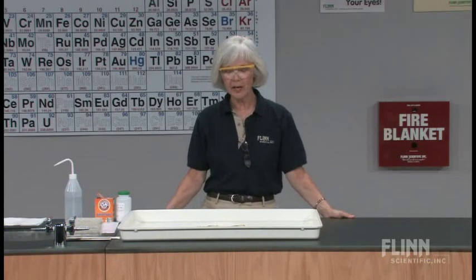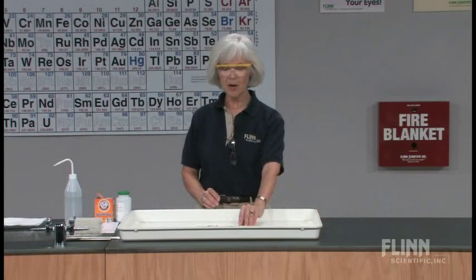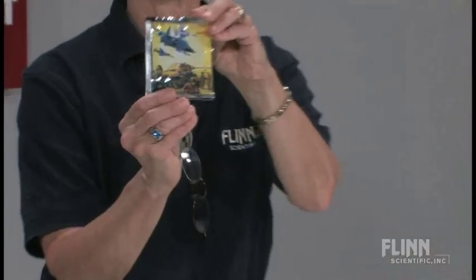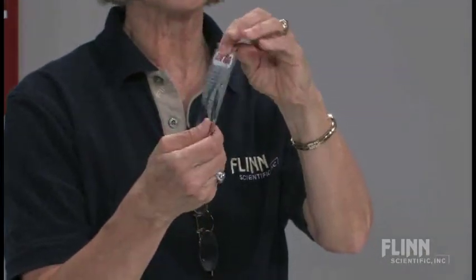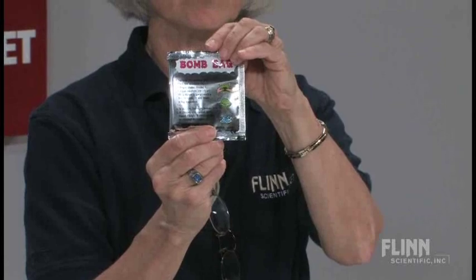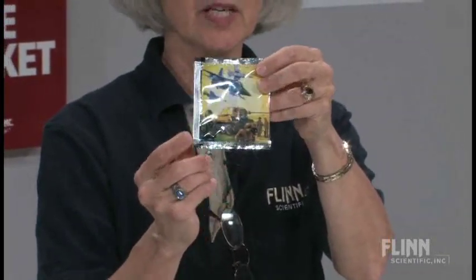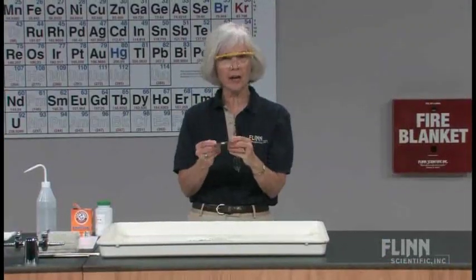This next activity that I'm going to perform is one in which I do it in the unit on chemical reactions. And what makes it fun for the students is that it involves a toy. And that item is known as the bomb bag. Now, maybe some of your students will have already seen this item because you can buy them at gag stores. But what I do with my students is I have them actually activate it.